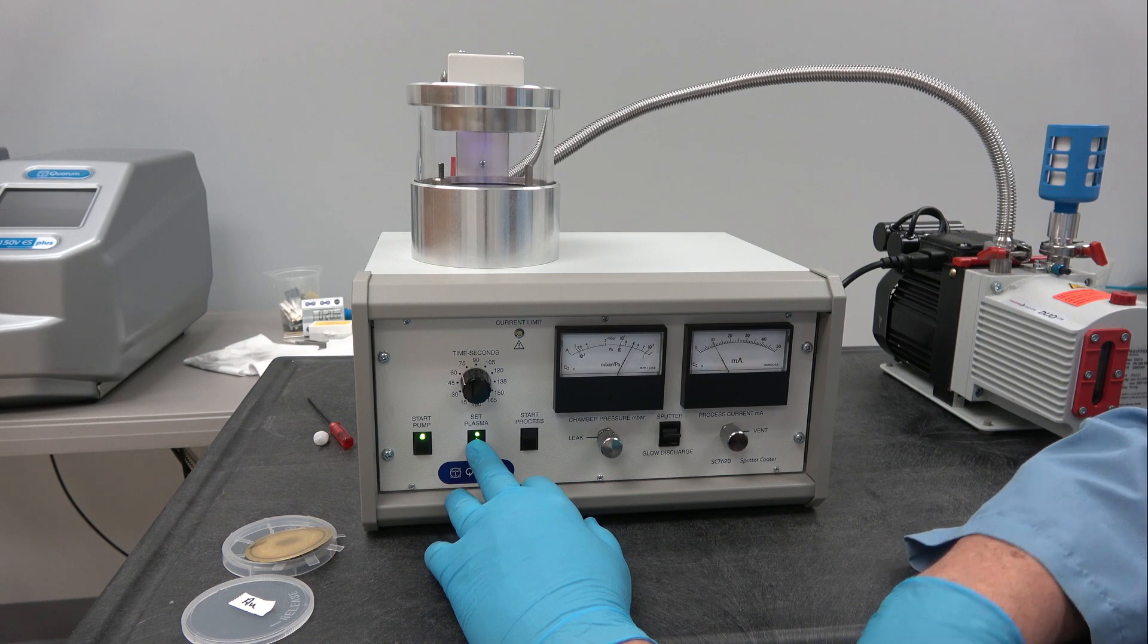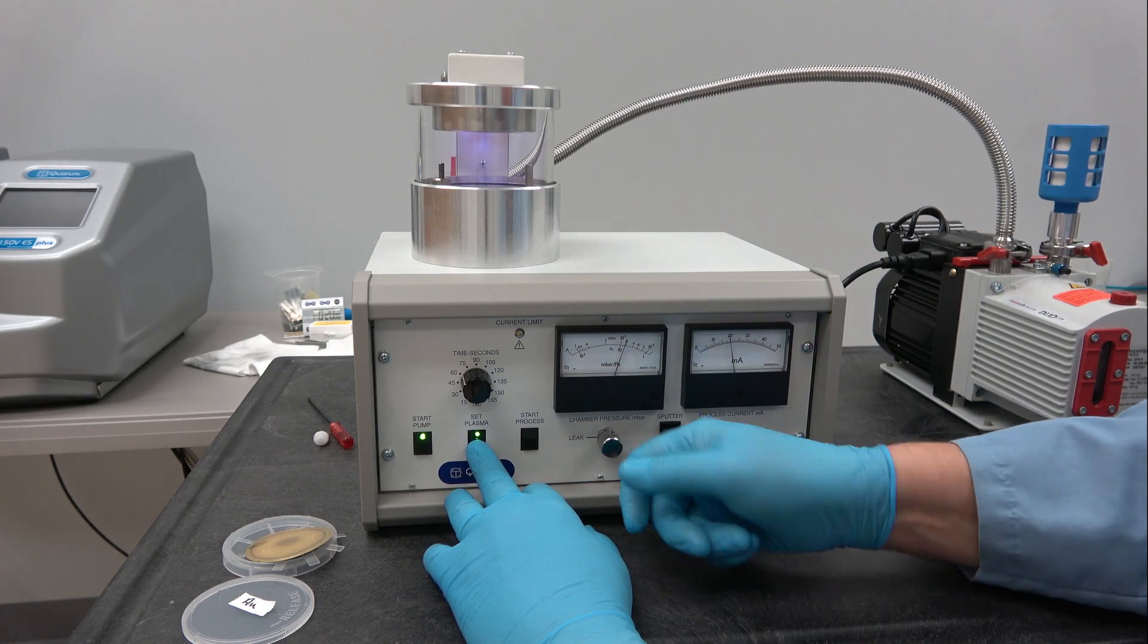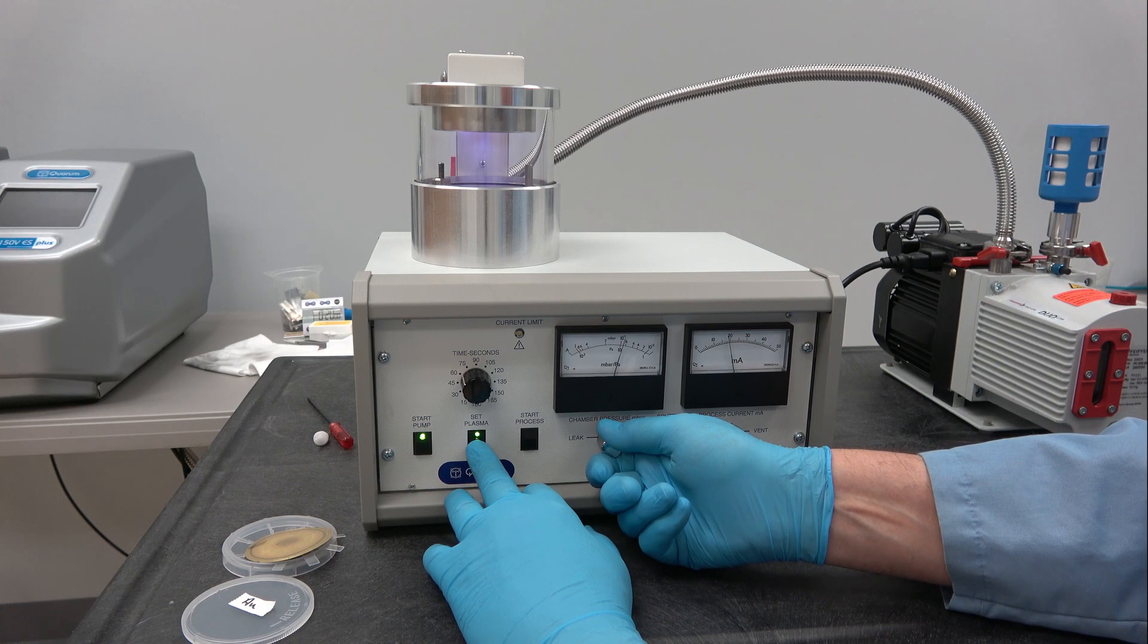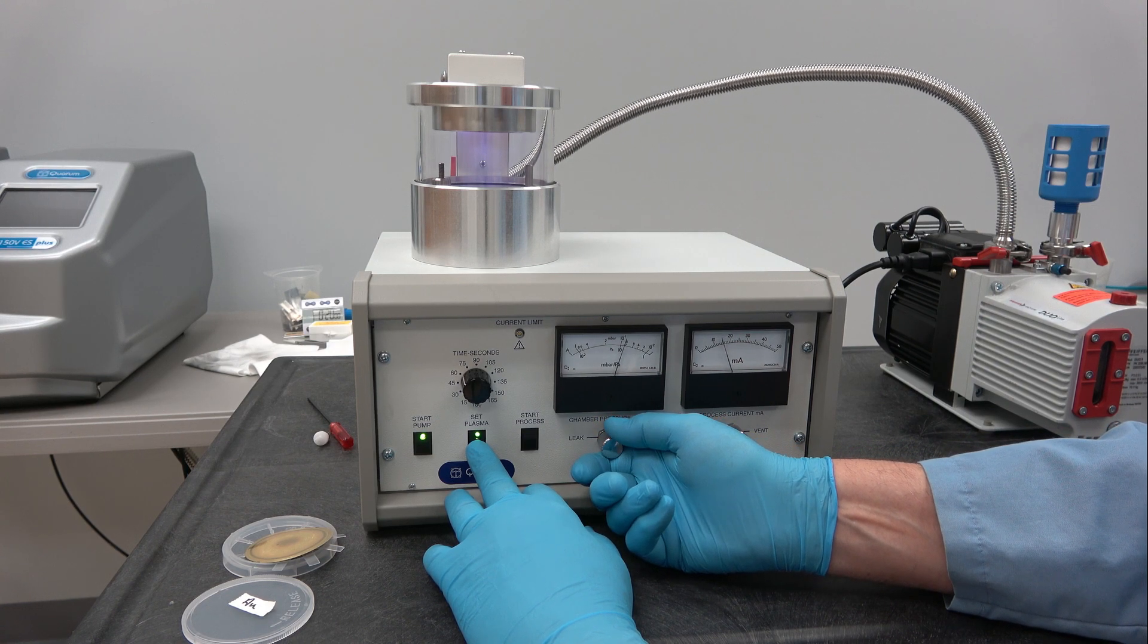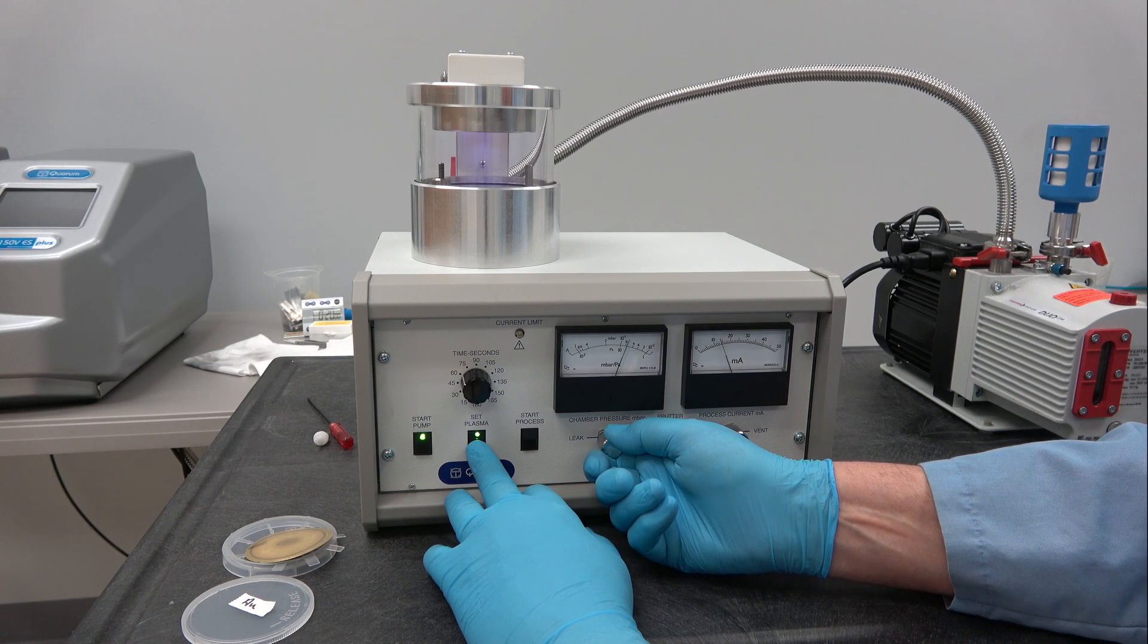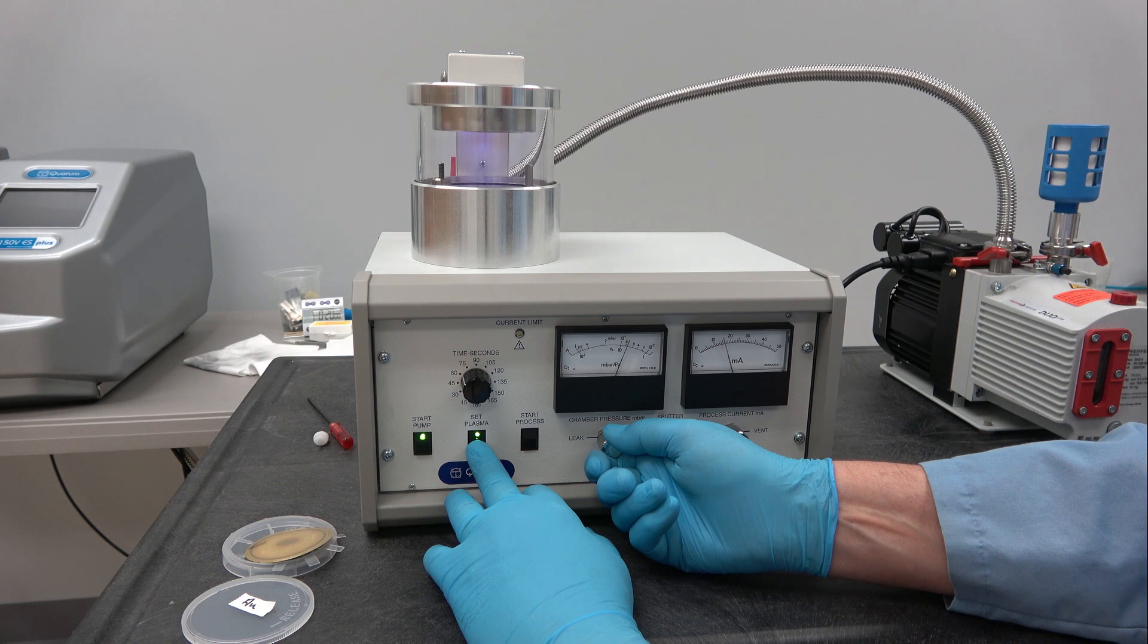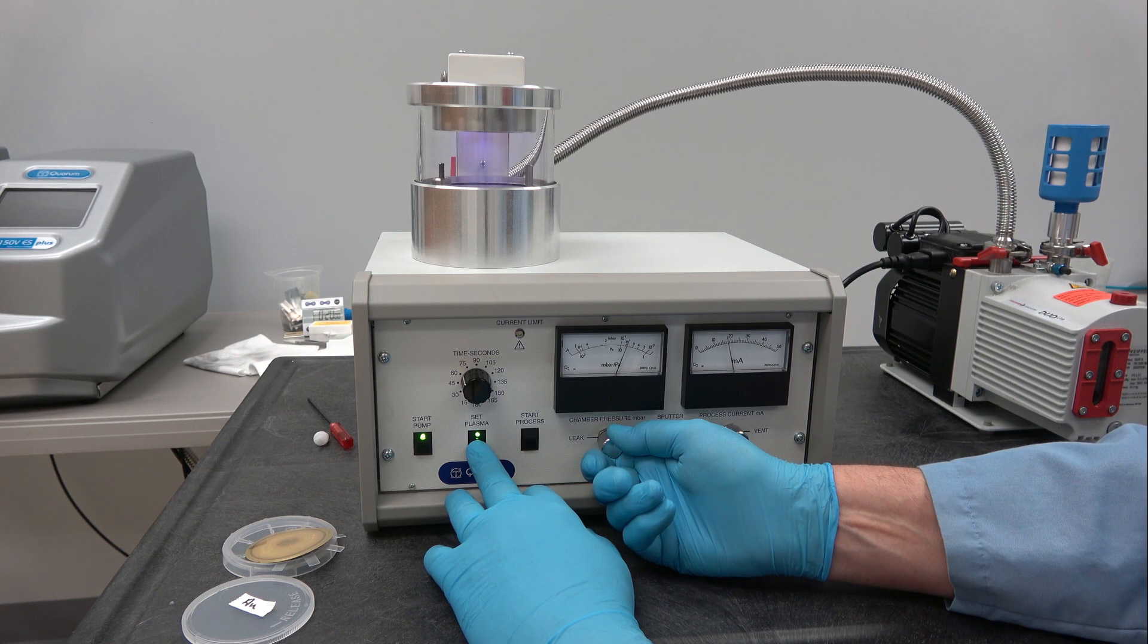We will press the set plasma button. We have a weak plasma. And now we can adjust the gas flow. Less gas, lower current. Higher gas, higher current. The higher the current, the faster the sputter rate is.